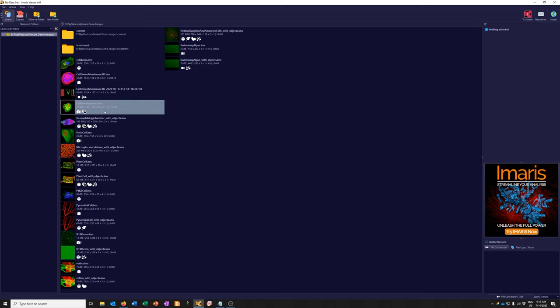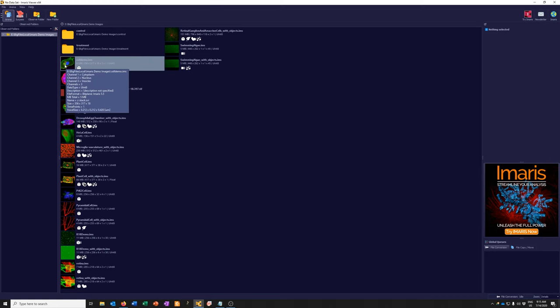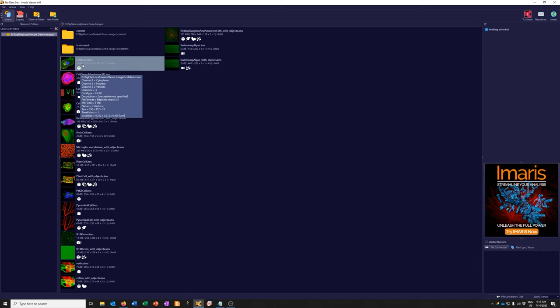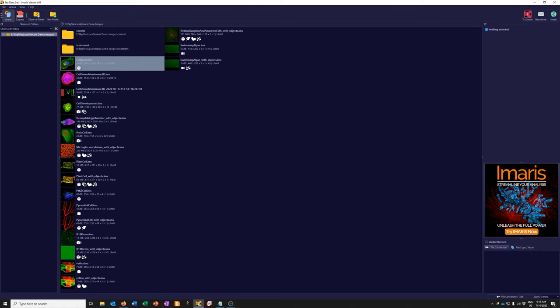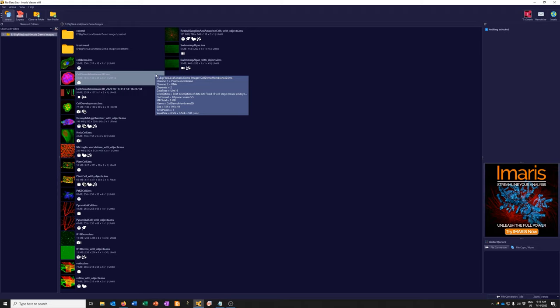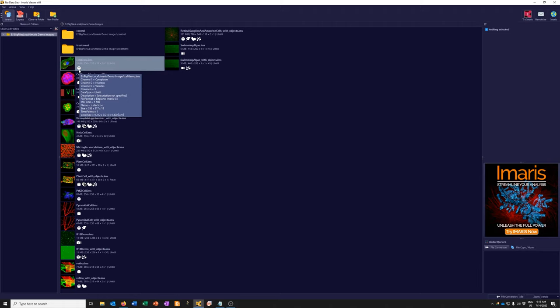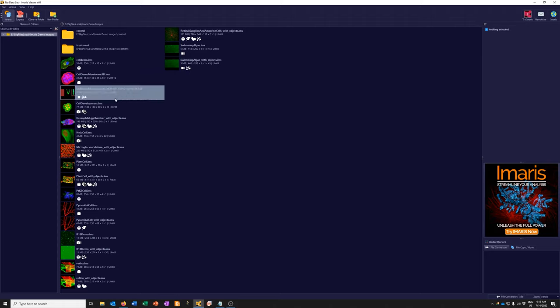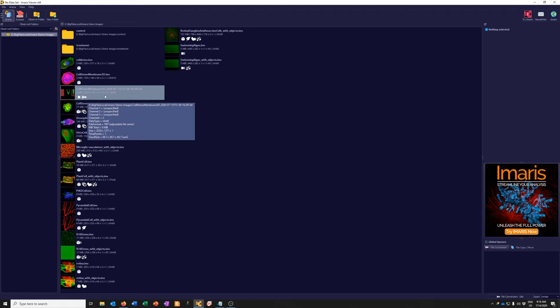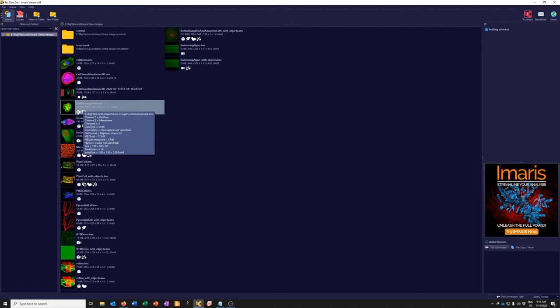For each data set, Imaris shows you little previews, plus the file name, the extension — which for all these files is .ims — and the size and dimensions in X, Y, Z, channels, and time. There's a shorthand icon for each image. Icons with a cube and lines mean they are three-dimensional data sets. Ones with a different icon mean they are not Imaris files and need to be converted.